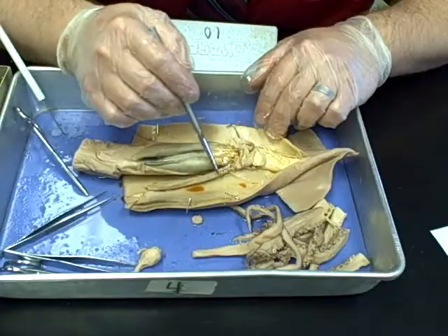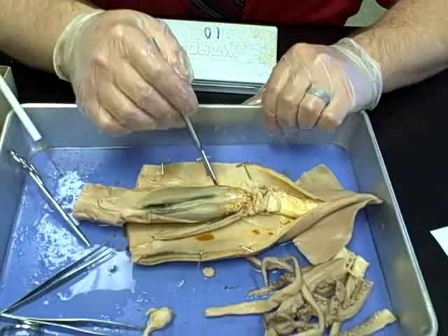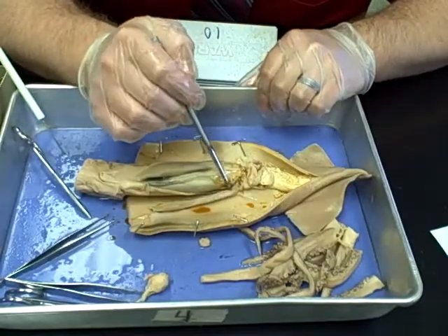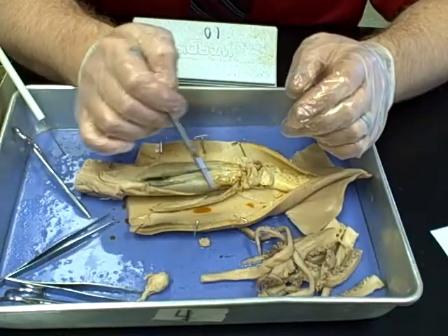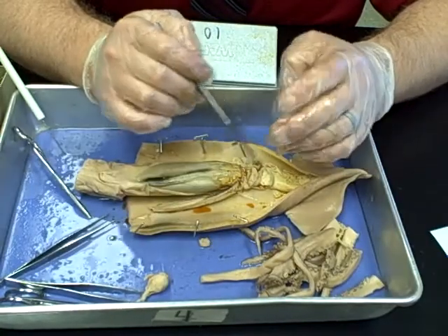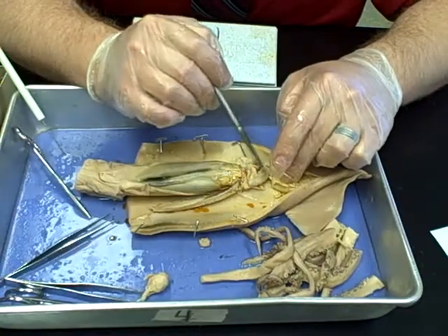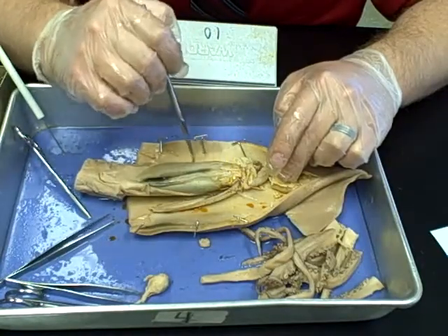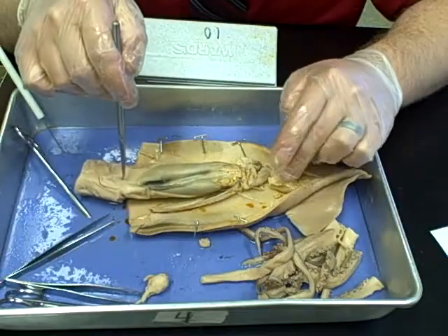Another very obvious structure is the gills — there's a set on each side of the squid. Those gills each have a heart attached to the top of them. There's actually a three-part heart structure: the branchial hearts pump blood down into the gills, and the systemic heart in the center pumps blood to the rest of the squid. The stomach is here on this side, attaching into the intestines, which run down inside the squid to the rectum, expelling waste through the siphon.